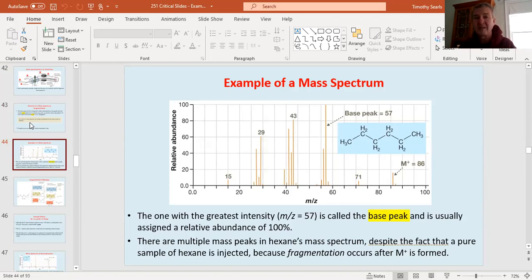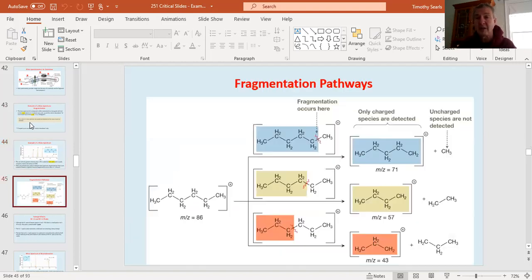Now, what are these littler peaks? What are these side peaks? Well, obviously, our atom isn't pure in the sense of isotopic purity. If there are isotopes, they will have an extra neutron or not have as many neutrons. You might have carbon 11 or carbon 13 or carbon 14, and you would get peaks representing those other possibilities. In some cases, these are signatures you can actually understand.